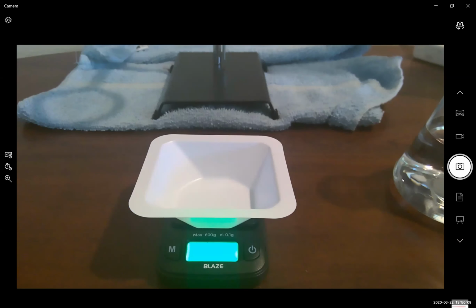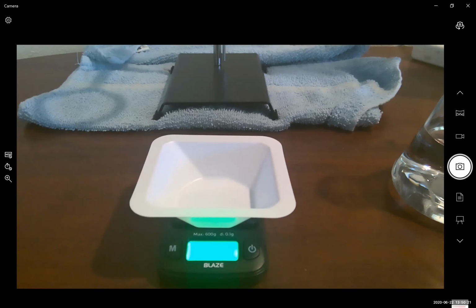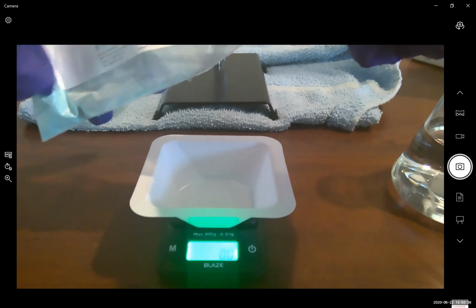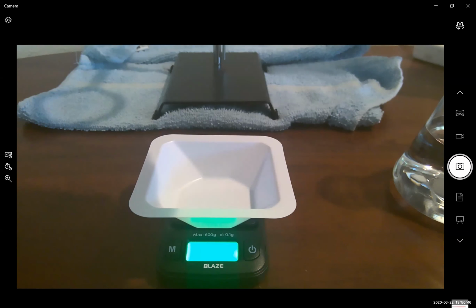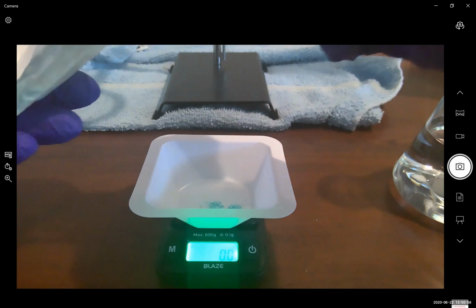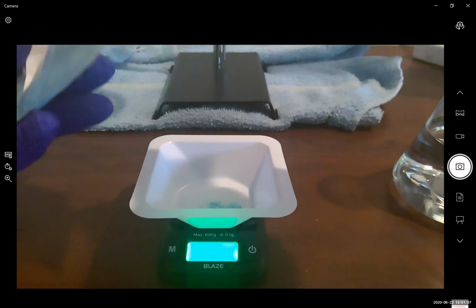Now, we're going to get out our bag of copper gluconate and weigh 1.4 grams. We have our spatula ready to go and we're going to carefully weigh out and transfer 1.4 grams of copper gluconate, keeping in mind that this should be done above your weigh boat. So all of your transfers, in order to minimize spills, should be done above your weigh boat. There's about 2 grams in your bag, so you're going to need almost the entire contents of your bag.